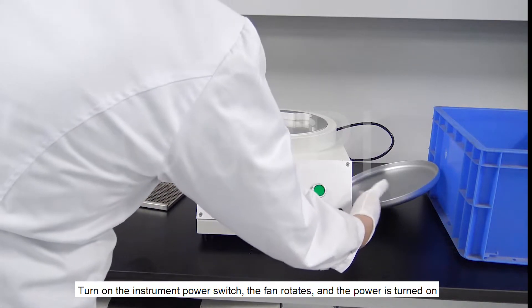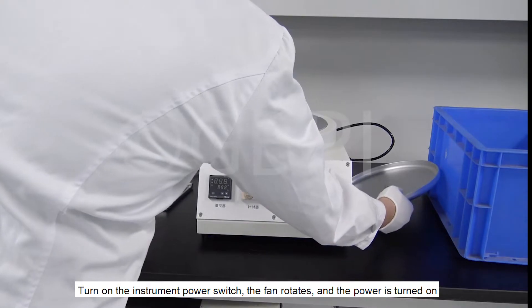Turn on the instrument power switch. The fan rotates and the power is turned on.